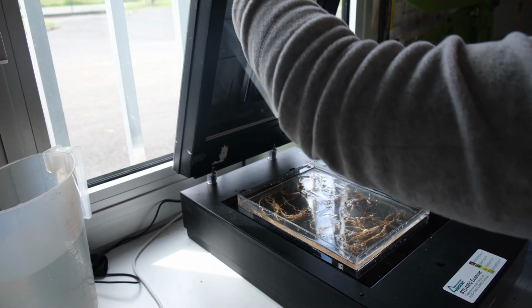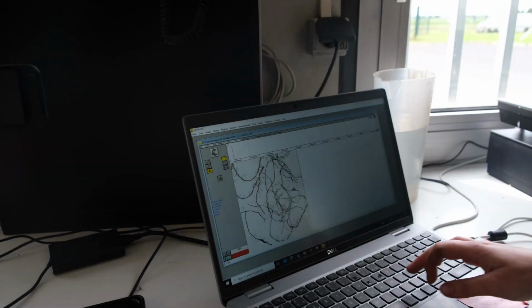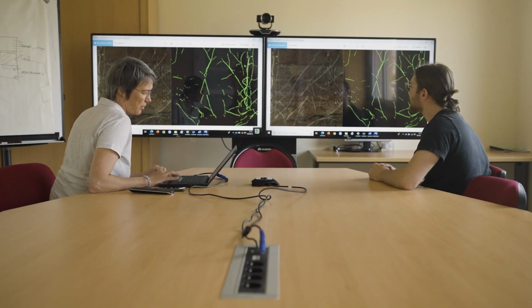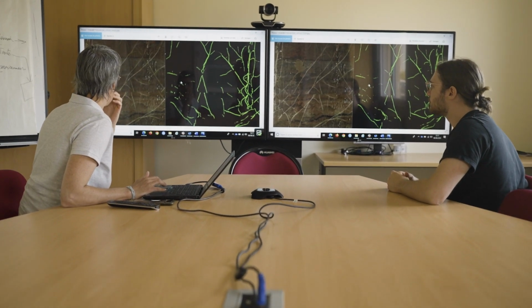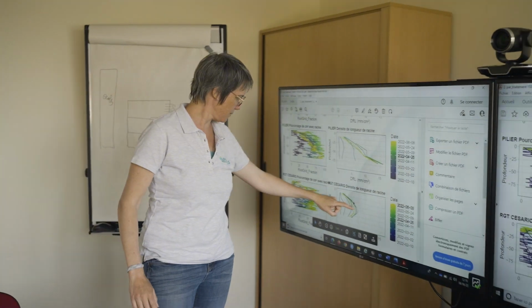Once the characterization is complete, the root system could be scanned with the WinRhizo software, which extracts the length and diameter of all roots from the image. Measuring root and above-ground biomass allows for the calculation of the root-to-shoot ratio.